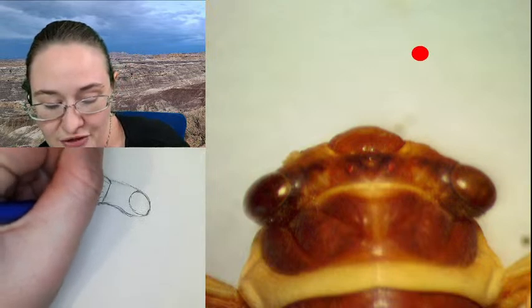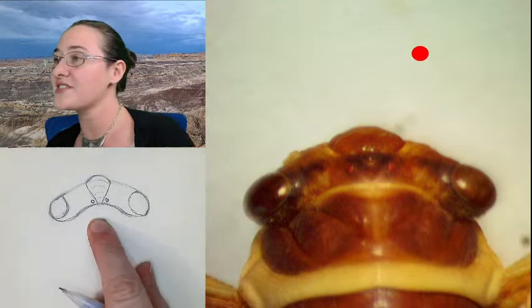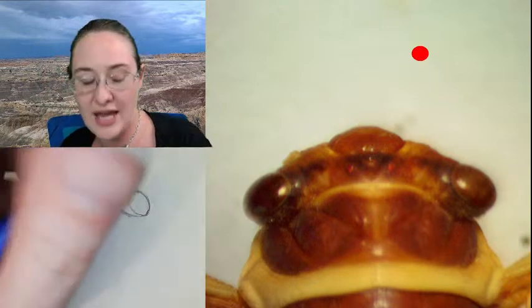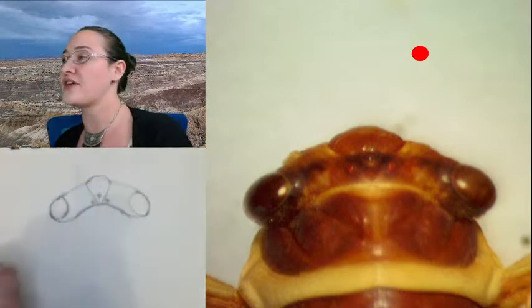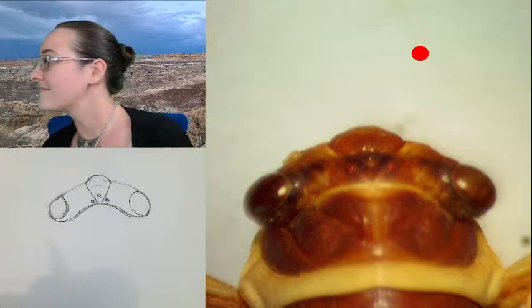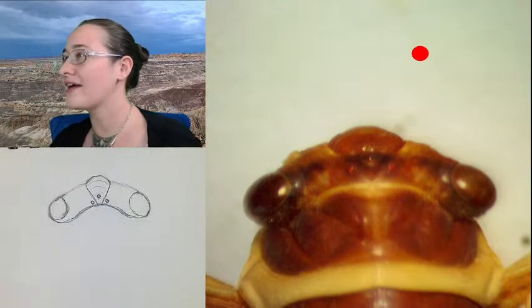Then we have the ocelli to the left of it and the ocelli to the right of it. Those are our simple eyes, right? Those don't see images, but they can see shading. And then the third one in the center that's actually pointing in that direction. Alrighty.